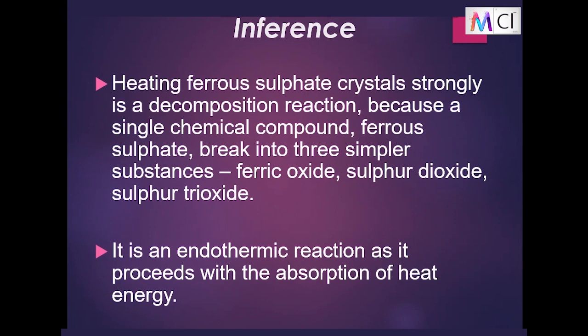Inference. Heating ferrous sulfate crystals strongly is a decomposition reaction because a single chemical compound, ferrous sulfate, breaks into three simpler substances: ferric oxide, sulfur dioxide and sulfur trioxide. It is an endothermic reaction as it proceeds with the absorption of heat energy.